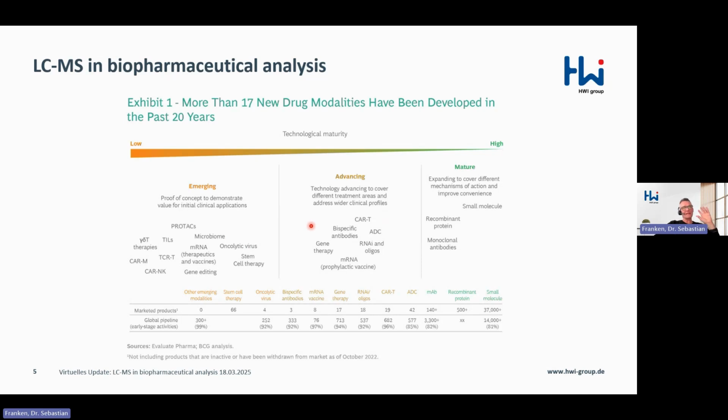Because of this increasing complexity, of course, the analytical techniques that we use to analyze these products have to become more and more complex, more and more sensitive, and more and more sophisticated, maybe. They have to mature, they have to grow together with these kinds of therapeutics.